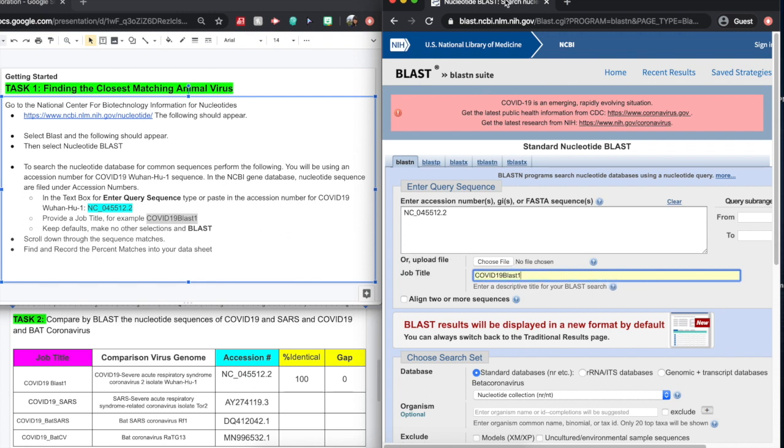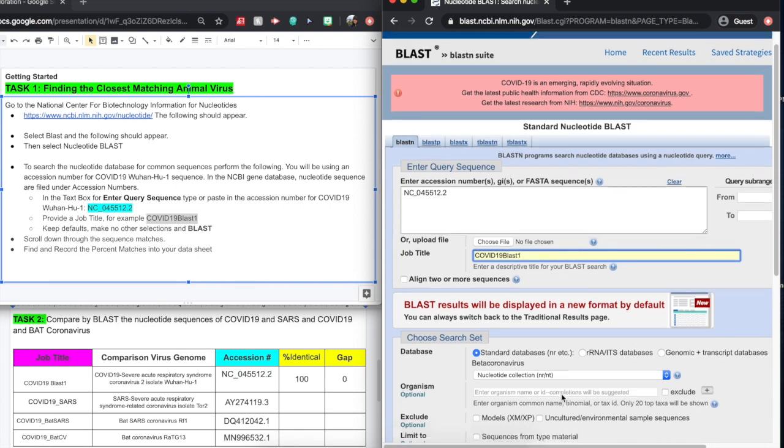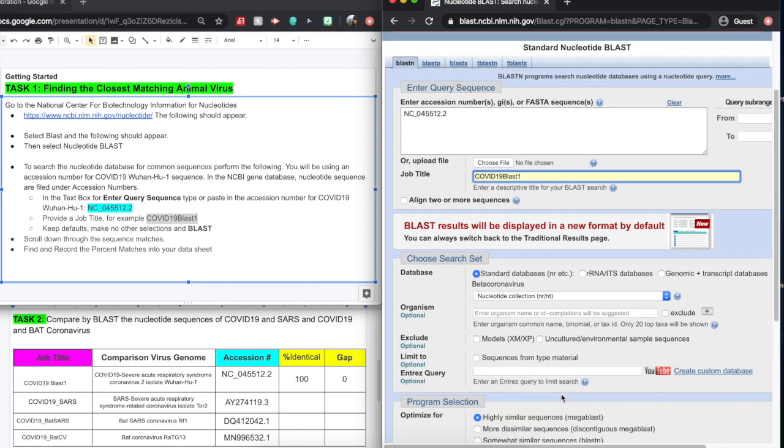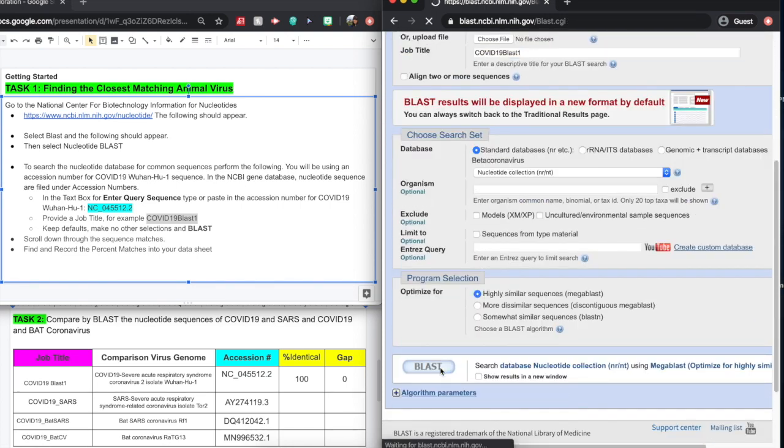That way, we don't lose track of everything. Our tabs are going to get quite full at the top, so it's really important that you do have a label for these titles throughout. There's nothing else you need to do here. Just scroll all the way down until you find BLAST and BLAST away.